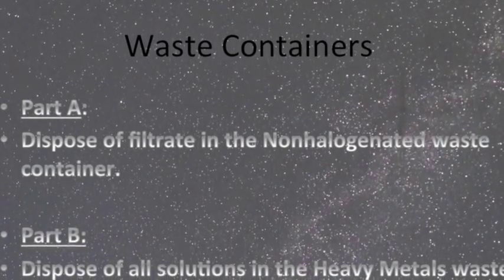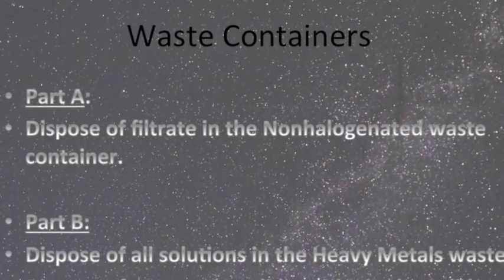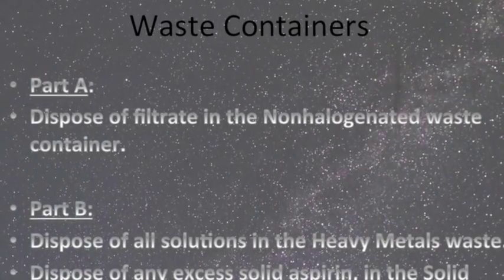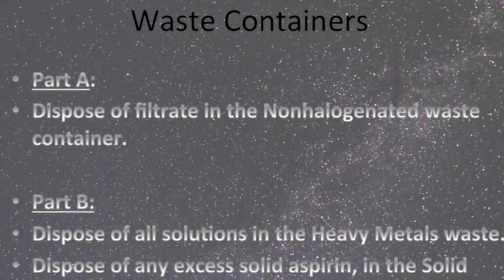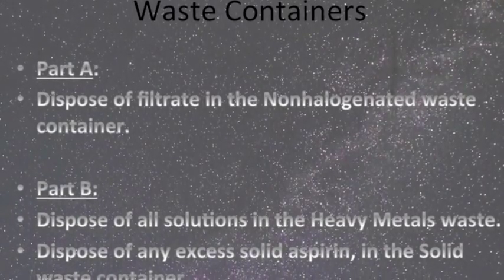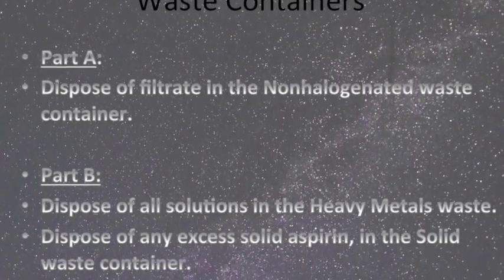Dispose of the filtrate solution from Part A in the non-halogenated waste container. For Part B, dispose of all solutions in the test tubes in the heavy metals waste container. Any excess solid aspirin should be disposed of in the solid waste container.